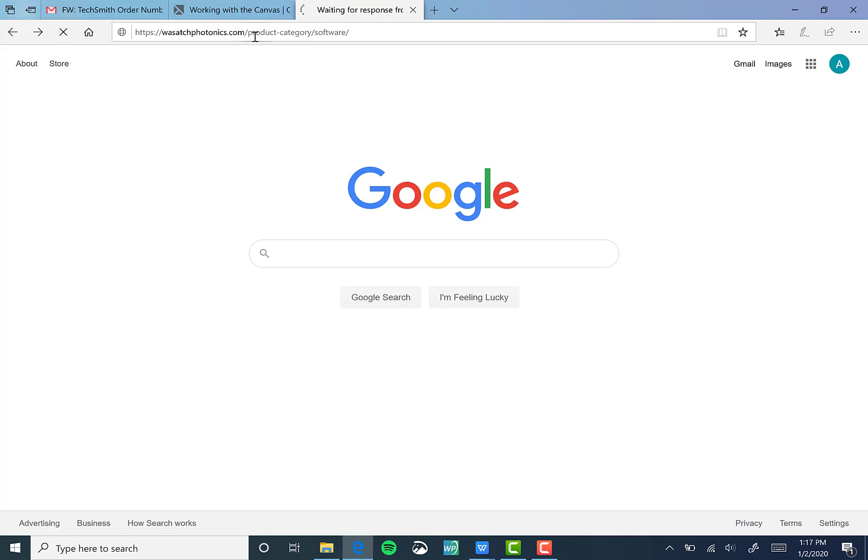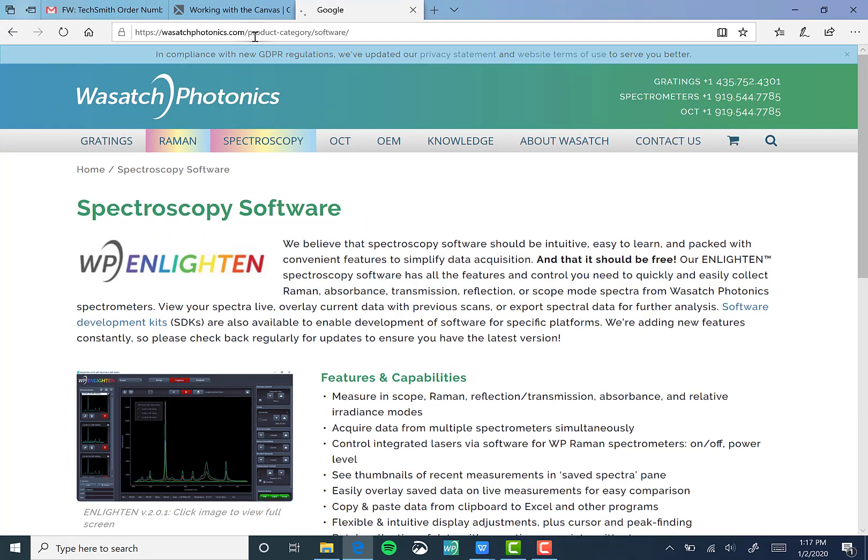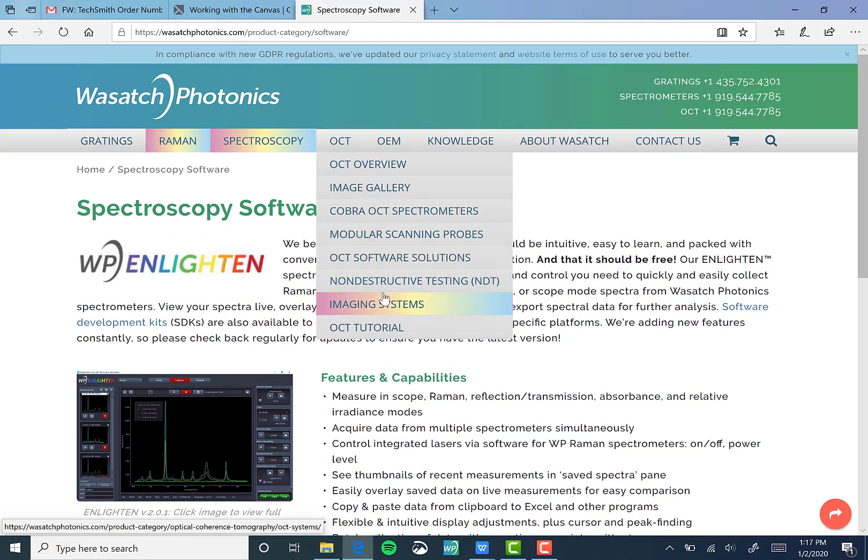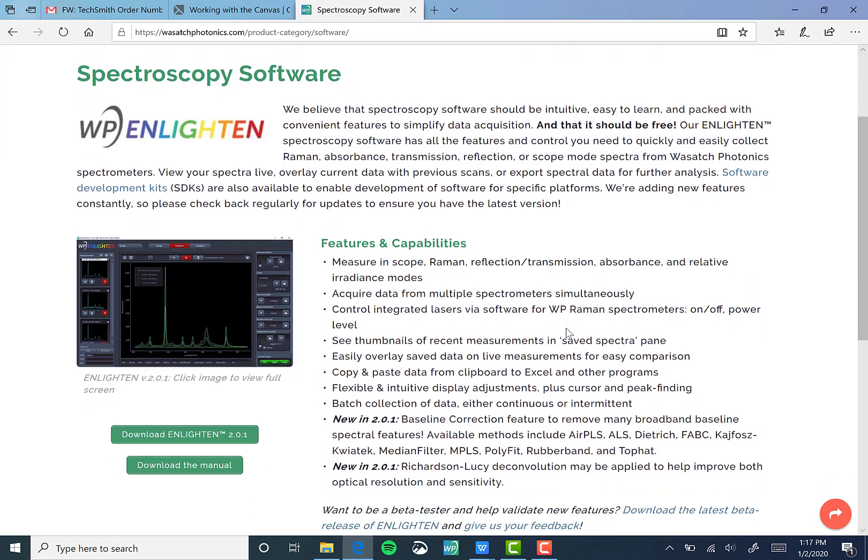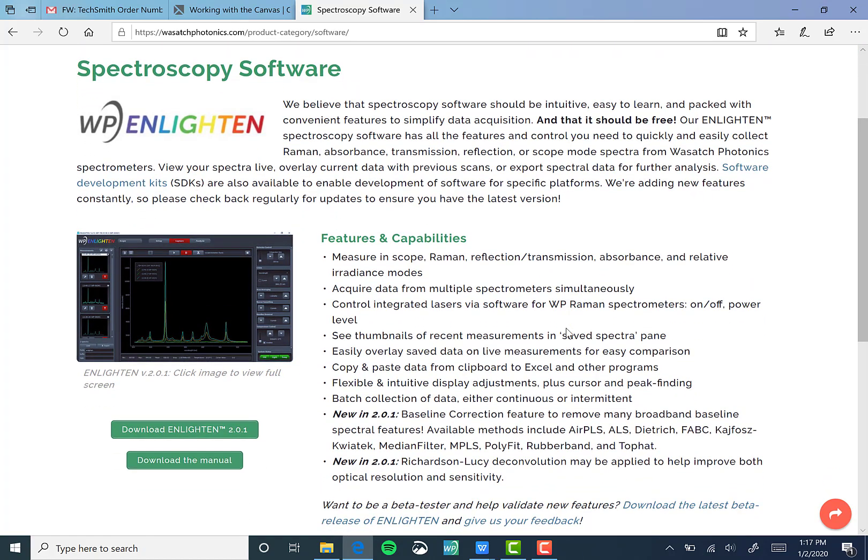This URL takes you to a page that if you scroll a little, you'll be able to download the latest version of Enlighten. At the time of this recording, that version is 2.0.1.